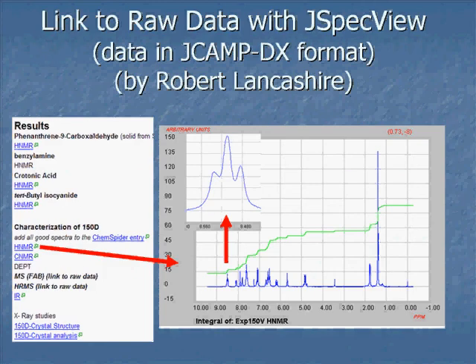And I'm a huge fan of JCamp that was mentioned a little bit earlier. This is really nice because with NMR data, with JCamp, you can use JSpecView through a browser and people don't have to download any software or even know that there's software involved. It's using Java, and they basically click on the spectrum, it pops up, and if you drag the mouse across the spectrum, it'll expand any area. So this is far superior to printing out endless expansions, because you just need to save it once, and then you can get your J constants at any point in time.